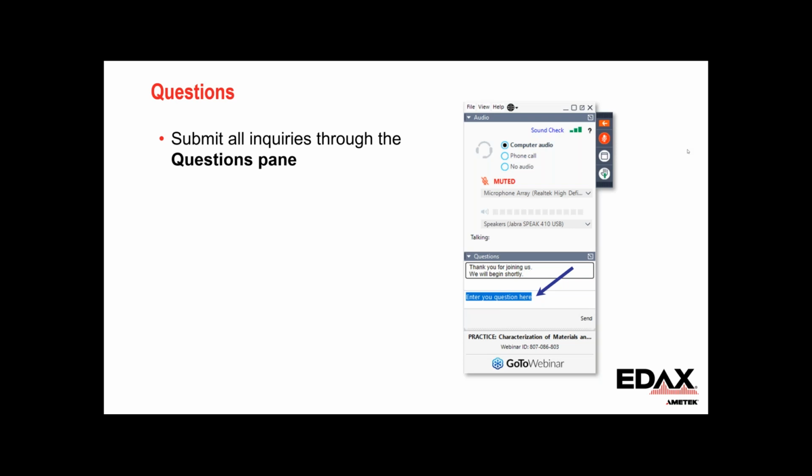I found that with the spherical indexing, I can get something like a 10th or a 20th of a pixel angular precision in simulated experiments, which for a 64 by 64 detector is something like a 1,000th of a degree. So the difference between binning is practically not going to make a big difference for forward model indexing. Hopefully that's a useful answer.